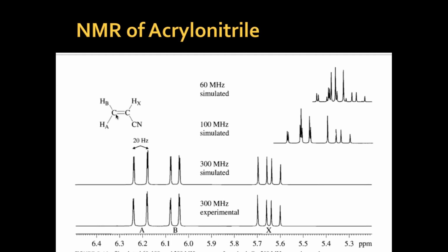So once we talk about downfield and upfield, downfield, or de-shielding, of the NMR is to go on the left of the NMR, which means the value will increase, and you will see more peaks in the down of the NMR. Down of the NMR means towards a higher number. Upfield means towards a lower number.